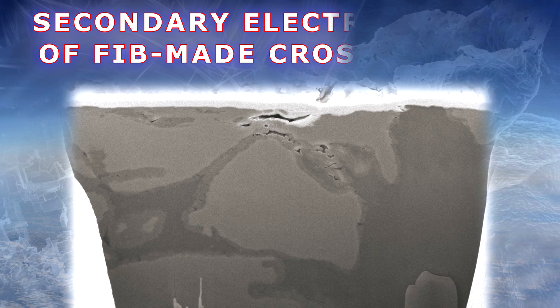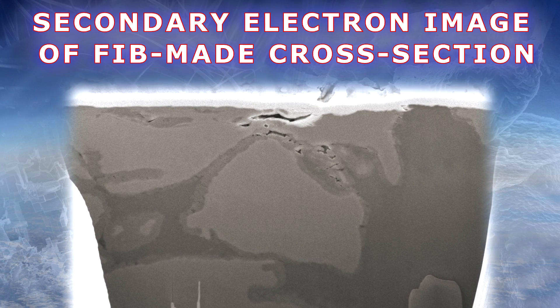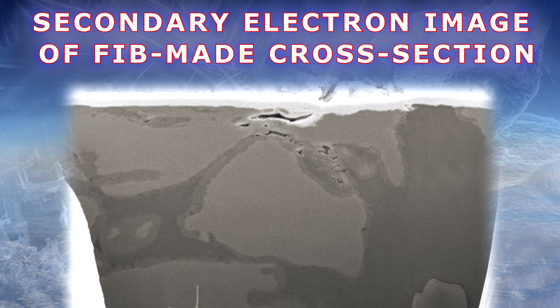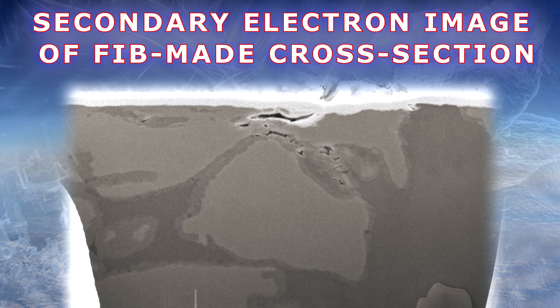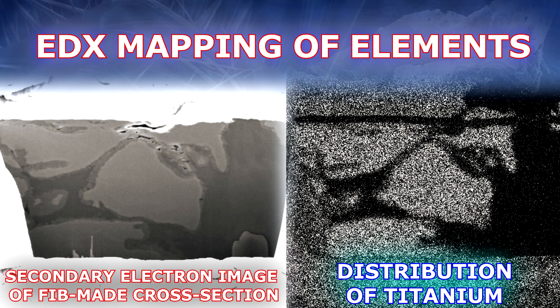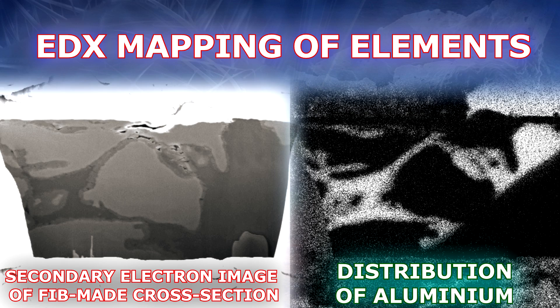As can be seen from the image, the alloy appears to consist of two different types of materials that are clearly distinguishable. Mapping the distribution of elements by energy dispersive microanalysis confirms that some regions have higher content of titanium, while others have more aluminum.